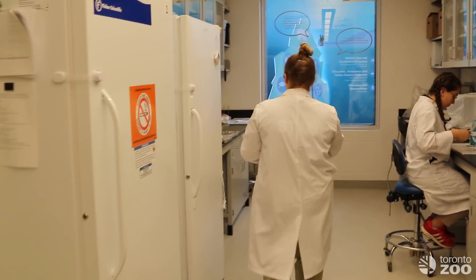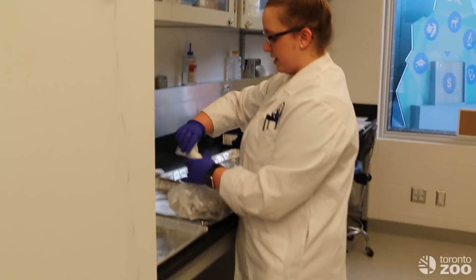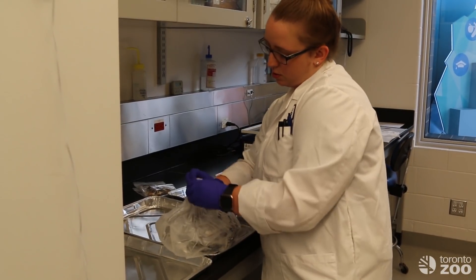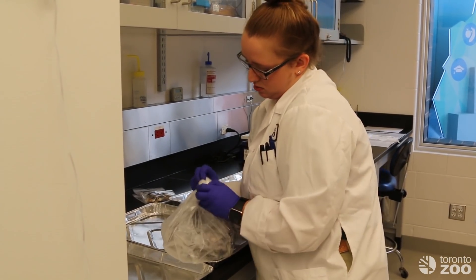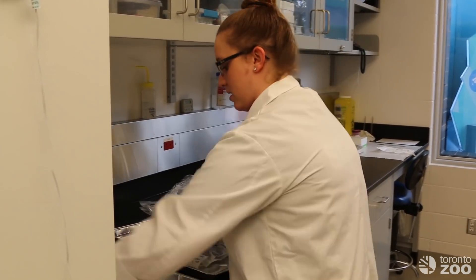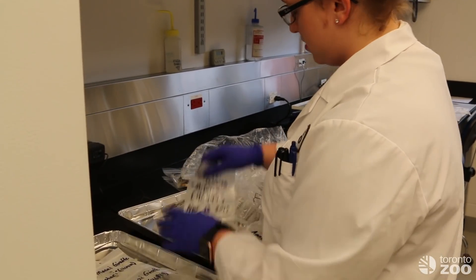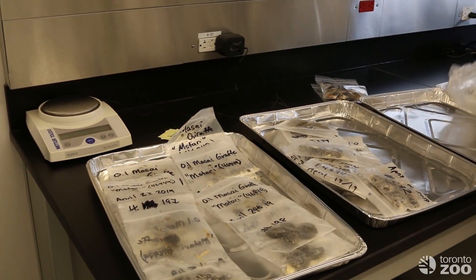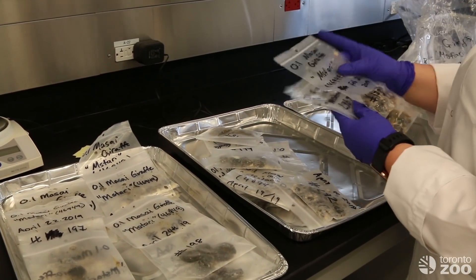So when we get the samples we want to make sure that they are organized generally by the date, so that when we look at the samples later the hormones are increasing or decreasing in order. We lay them out so that they can thaw, so that it is easier for us to crush the poop and weigh out the amount that we need.